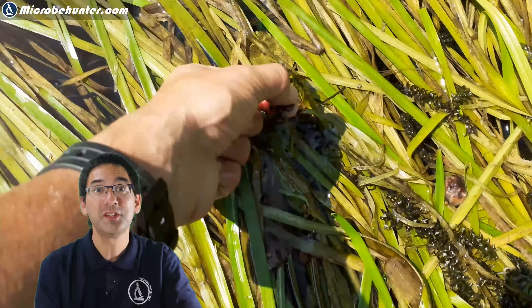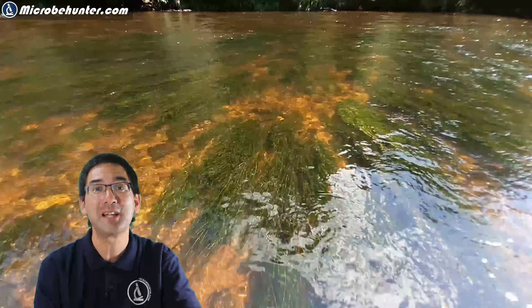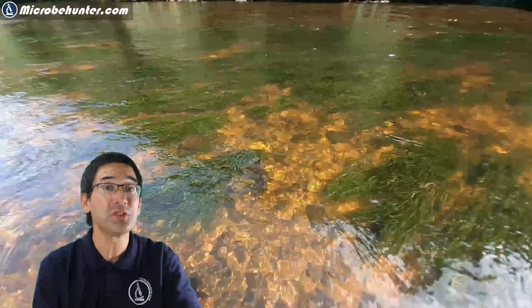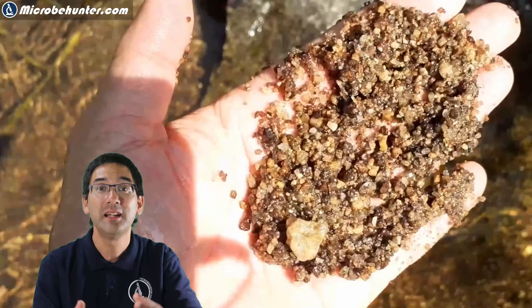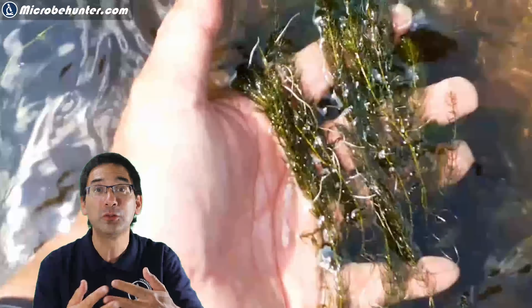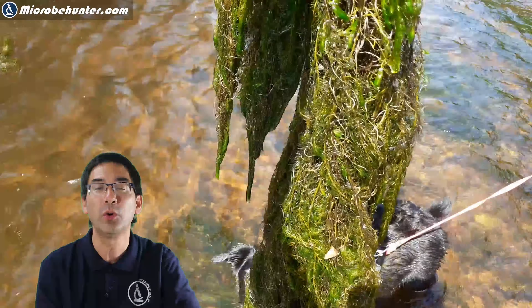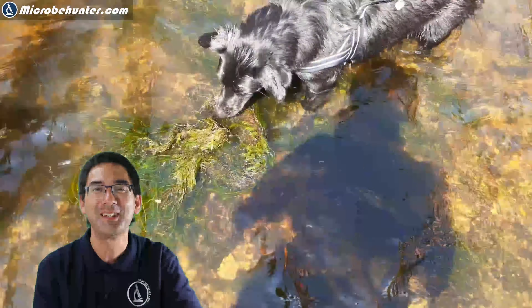I did not know which ones to take along, but I did find a couple of familiar species — Elodea, for example, which I already knew because I had them inside my aquarium many years ago. The river itself was only knee deep and going over it I could see a lot of different plants, and the sediment was also very interesting. I decided to take a few samples of water plants simply to see what microorganisms are growing on their surface, and maybe to put the water plant directly under the microscope to see what's going on inside the cells.